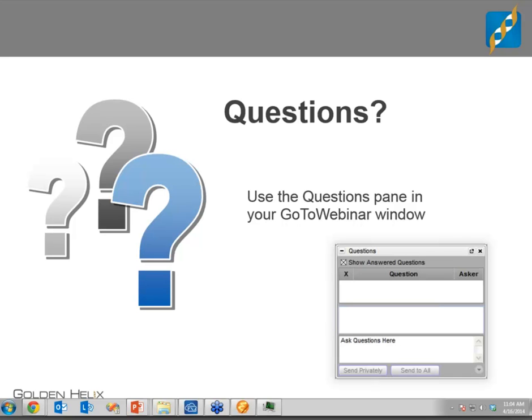Okay. So go ahead. I was going to go on to the next question. What if there are already SNV mutations in the seed sequence? Right. If by the seed you mean the reference genome, then you're absolutely right. There are places in the reference genome that have copy number repetition. And there are places in GRCh38 that have multiple alternate locations, given that there is such a high level of variability within the human population of these very large mutations or very large haplotype changes.